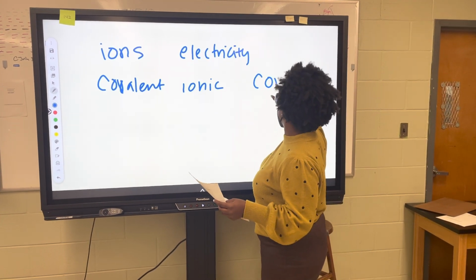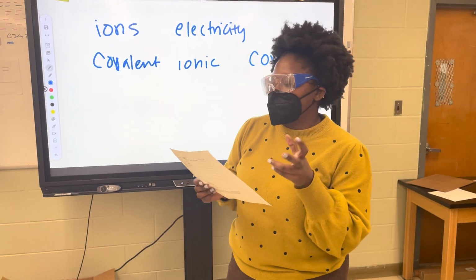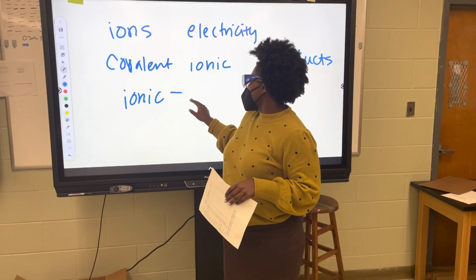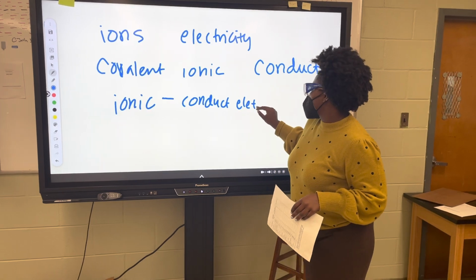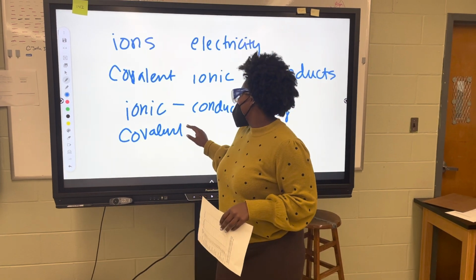Okay, so after reading this, we can deduce and summarize this in a simple chart. Ionic compounds conduct electricity, and covalent compounds do not.